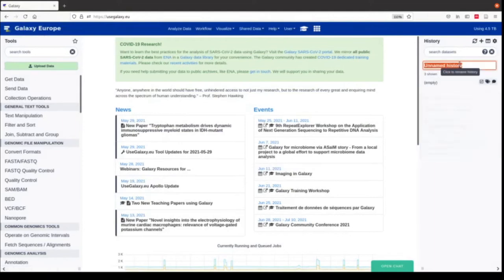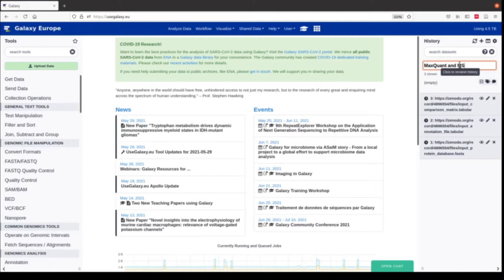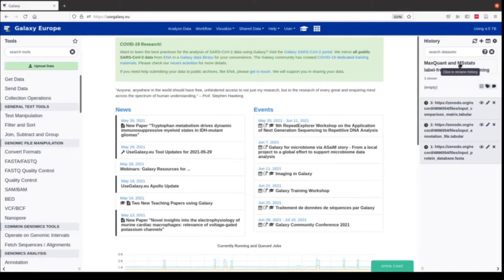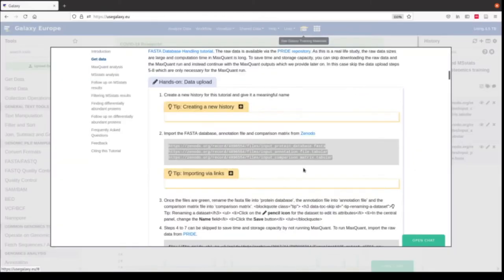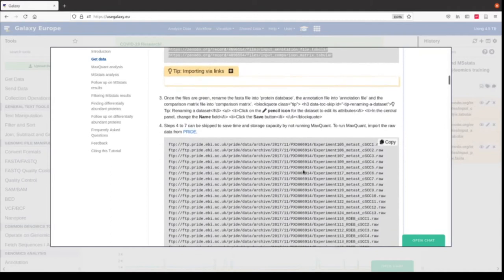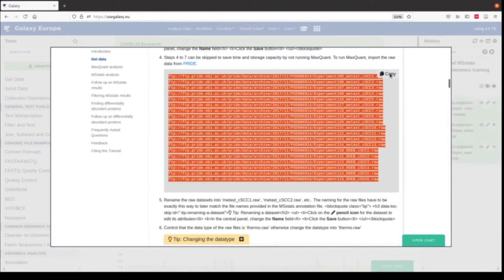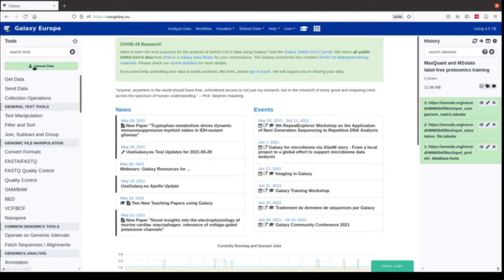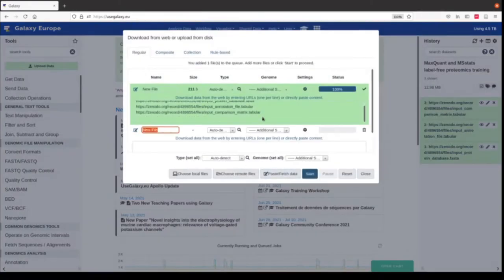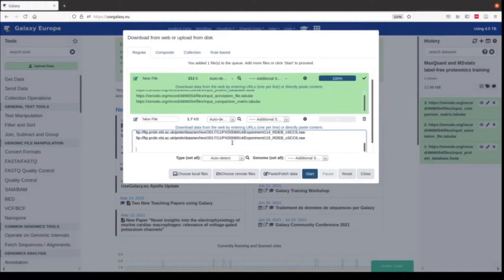We can give our history a name — this is the MaxQuant and MSStats label-free proteomics training. We also have data on the PRIDE database. This is an open repository for proteomics raw data and, as we use real live datasets, we copy the raw data from there. We can do this with the upload button again: go to upload data and paste in these links.